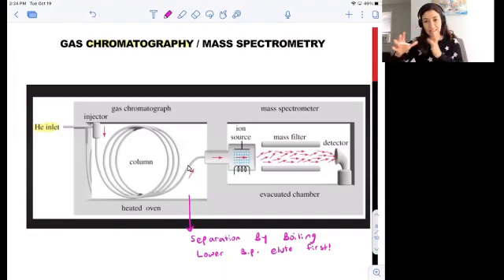By coupling this gas chromatography to mass spectrometry, we can gain information about the material that exits the column at different time points. So as our vapor molecules elute from the column, they enter a mass spectrometer. So you'll recall from our previous pre-lab discussions that these are basically ionized in the presence of an electron beam. And once these molecules have ionized, they are detected by a mass detector that can tell the exact mass of each individual molecule that has eluted from our gas column.